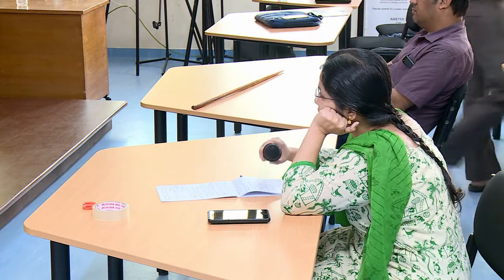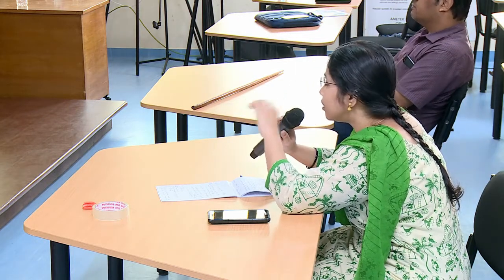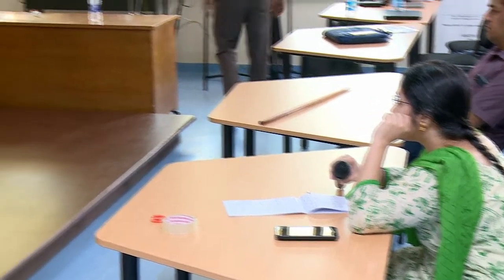But the patterns look okay? I think so. It's a deformed sample. It's really faint, but yeah. So if you can see the bands in the pattern, my guess is the structure file that you're using for the phase has probably not been optimized correctly and doesn't have the right reflectors in it.